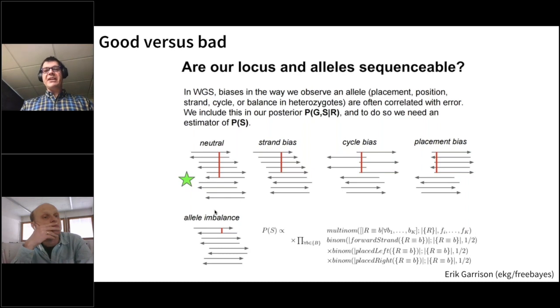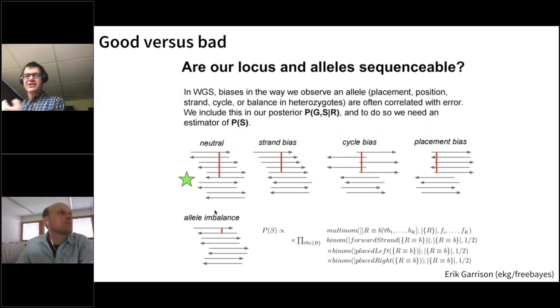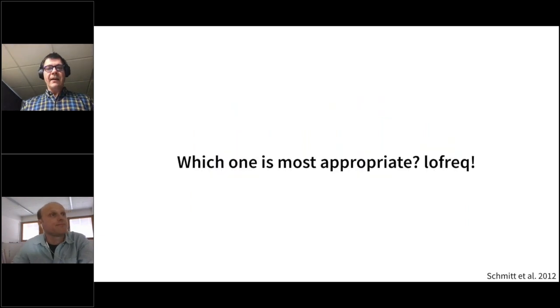And again, lowfreq scores sites based on some of these metrics. It also outputs some of these metrics, so you can, for example, do additional filtering yourself. I should also mention that freebayes also outputs them. Freebayes is probably the best tool in terms of outputting various kinds of metrics which you can post-process. But based on our experience in this framework, freebayes just calls too much. It calls the right sites too, but it overcalls in our hands.